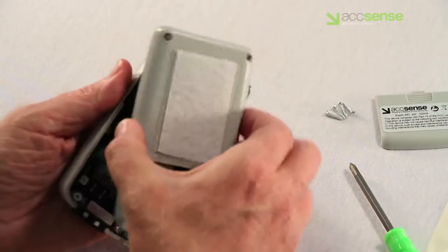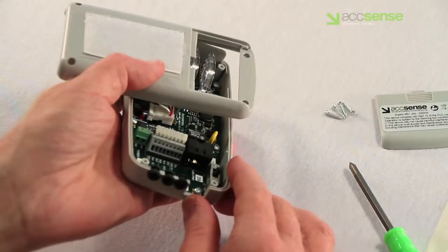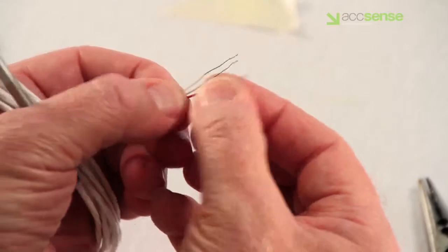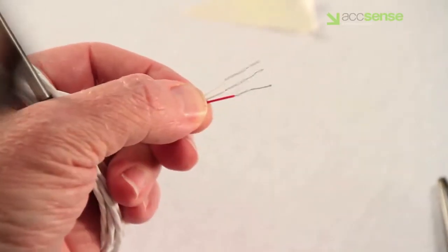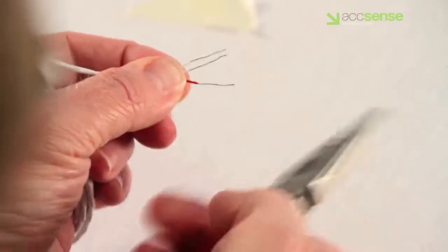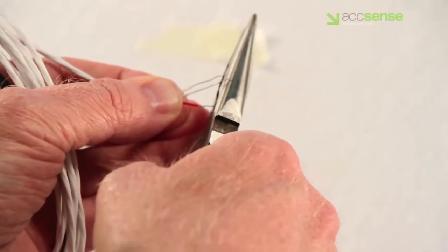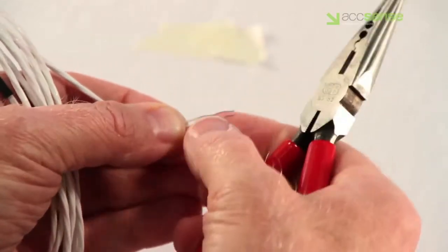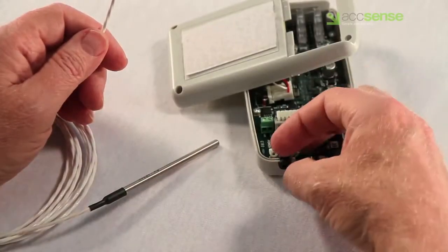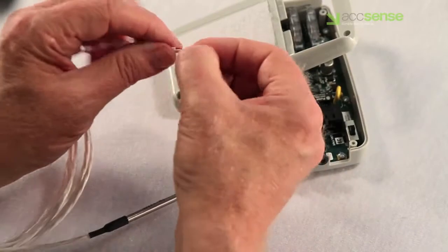Turn the back by 90 degrees to expose the terminal block and the case grommets. Before you install the probe, check the stripped length and shorten the length of exposed wires to a maximum of one-quarter inch to prevent short-circuiting of the wires if they become twisted. Then remove the case grommet and slide it up the jacket of the probe cable for later positioning back in the case.